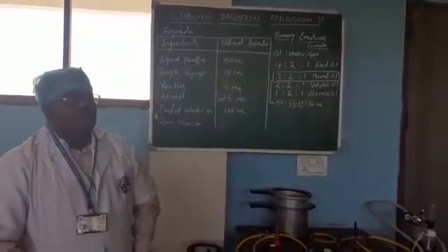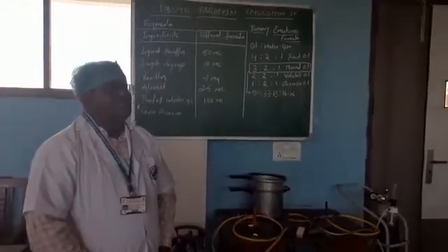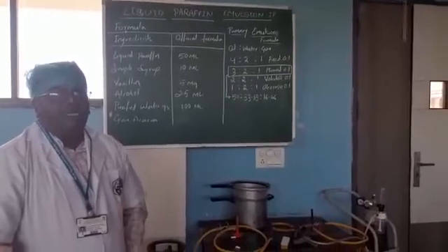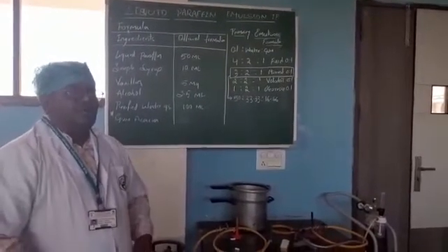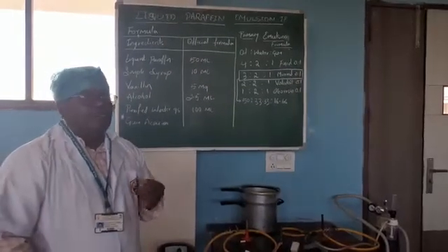There are basically two methods for preparation of emulsions in the laboratory. One method is dry gum method and another method is wet gum method. Out of these two, I am going to show you how the dry gum method is used in the preparation of this emulsion.